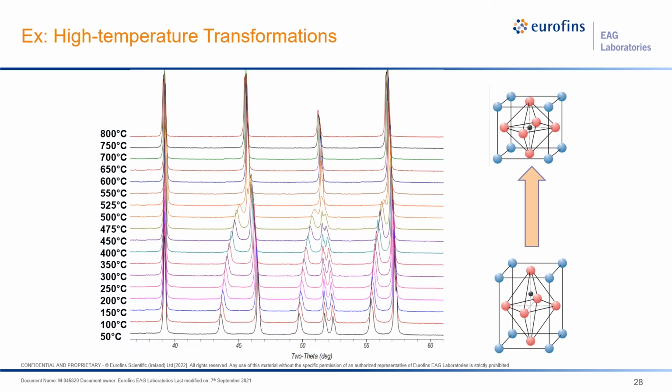We increased the temperature of the sample in our high temperature sample stage while under vacuum, stopping to collect a full spectra at roughly 50-degree increments. Here you can see the diffraction pattern changes with an increase in temperature. Some of those split diffraction peaks begin to come together as the symmetry of the unit cell increases with the transition to the cubic form.